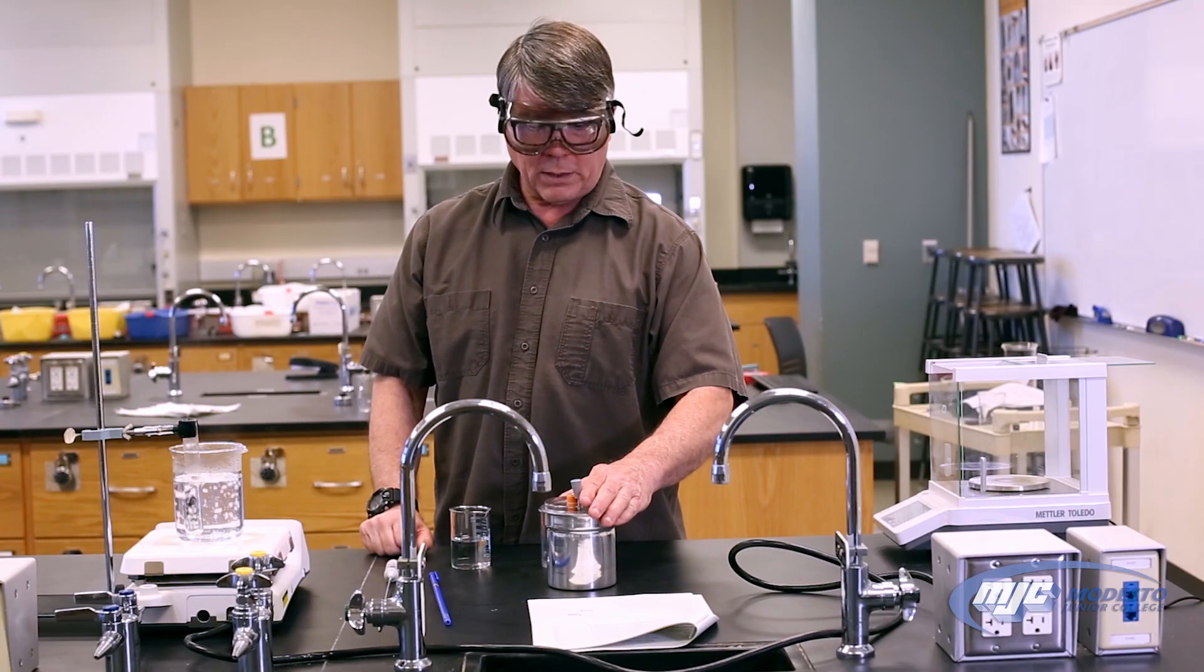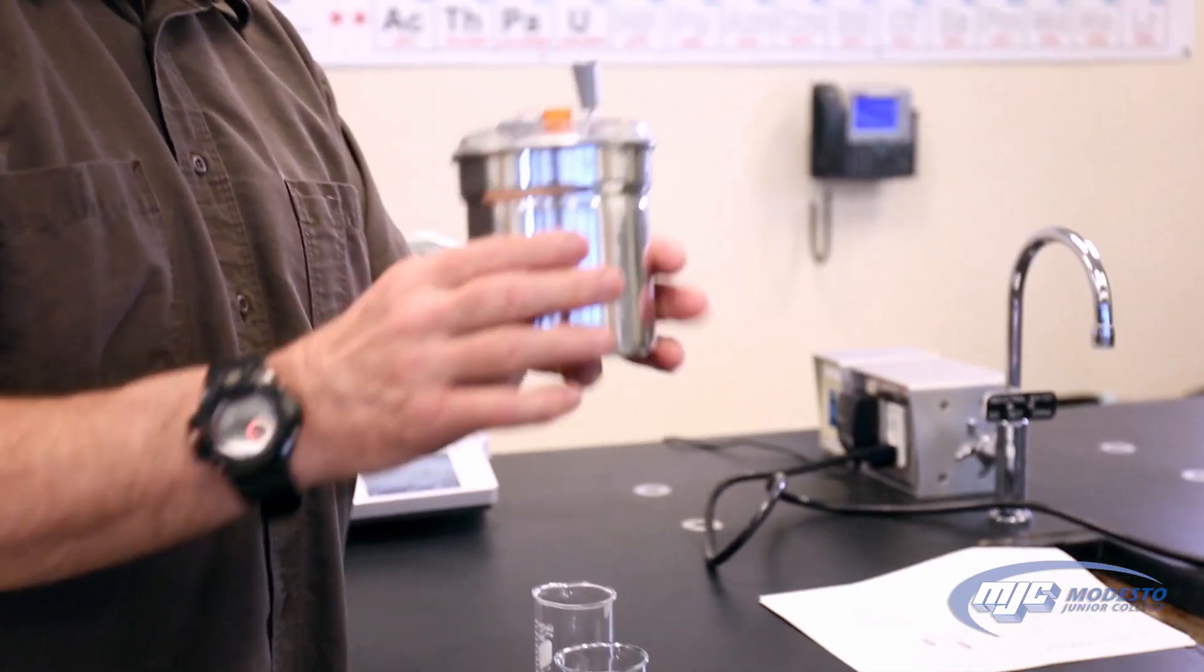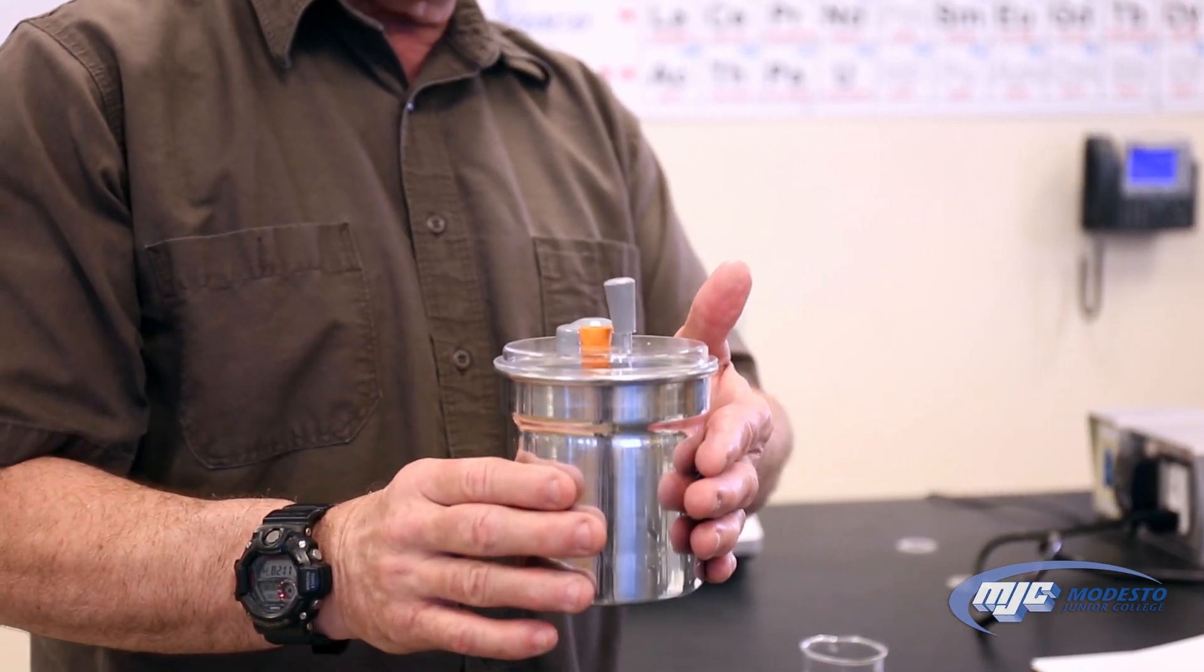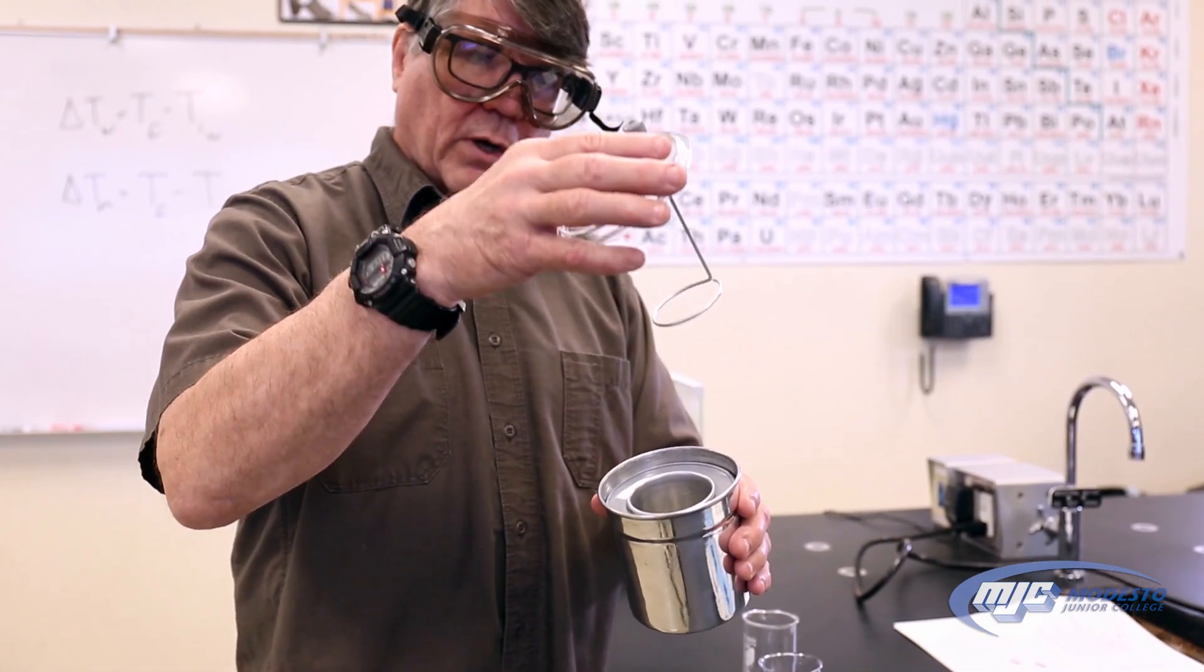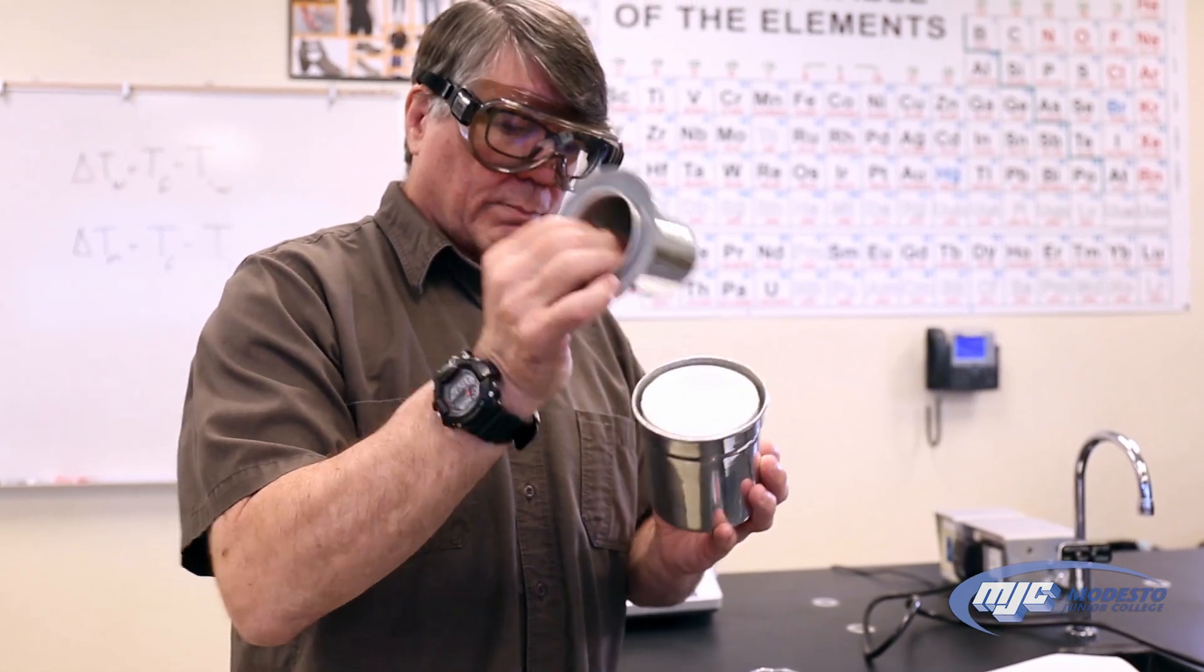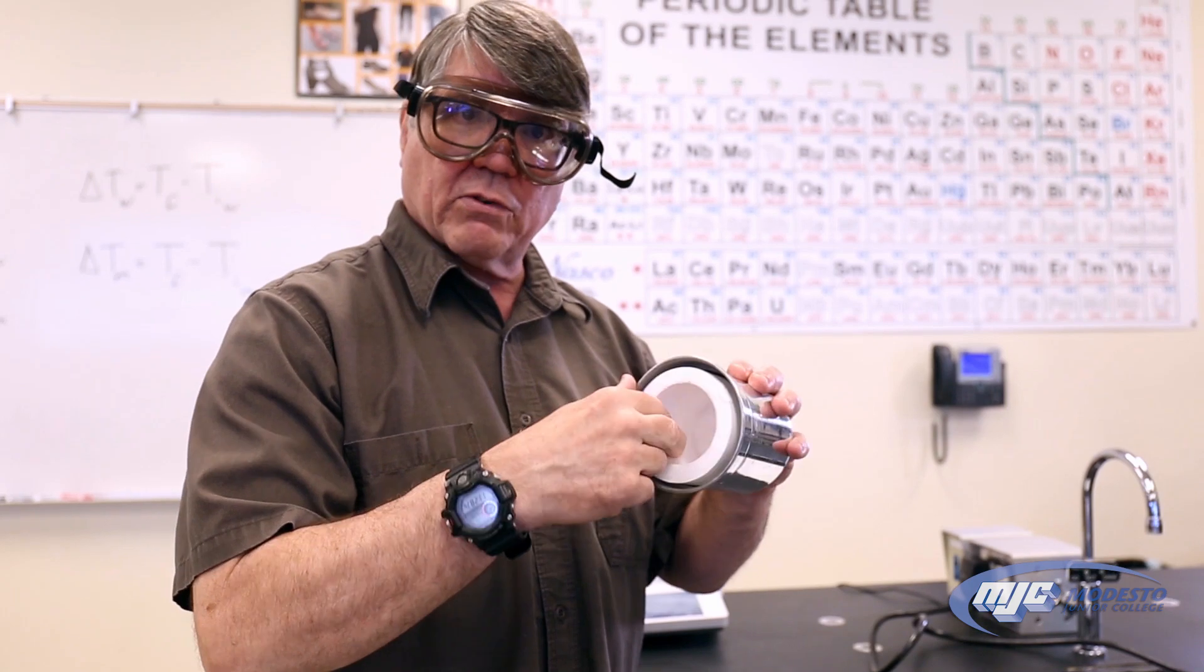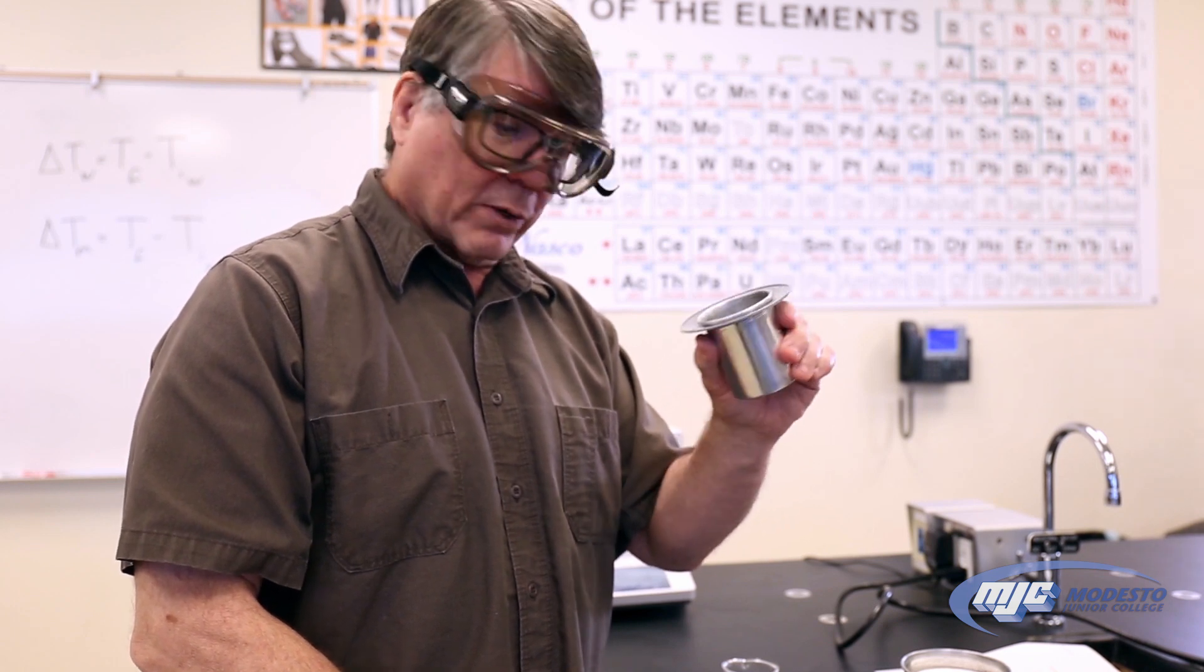Another measurement we said we need is the mass of the water. So this is your calorimeter and this is the tool that you're going to use to do this experiment. Now it has a lid. It comes off like this and inside this calorimeter looks like this. There's a metal cup in here. It comes out and there's a styrofoam insulation inside here which we're going to keep in there. This is where the water's going to go and eventually the hot metal is going to go in there too.